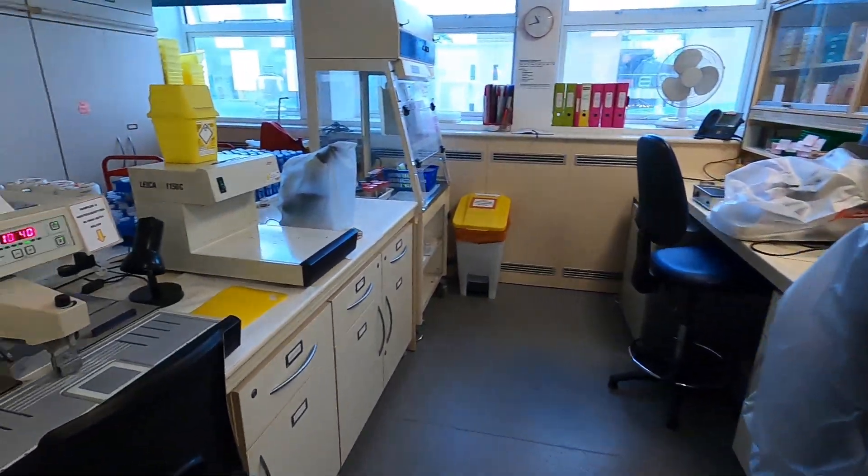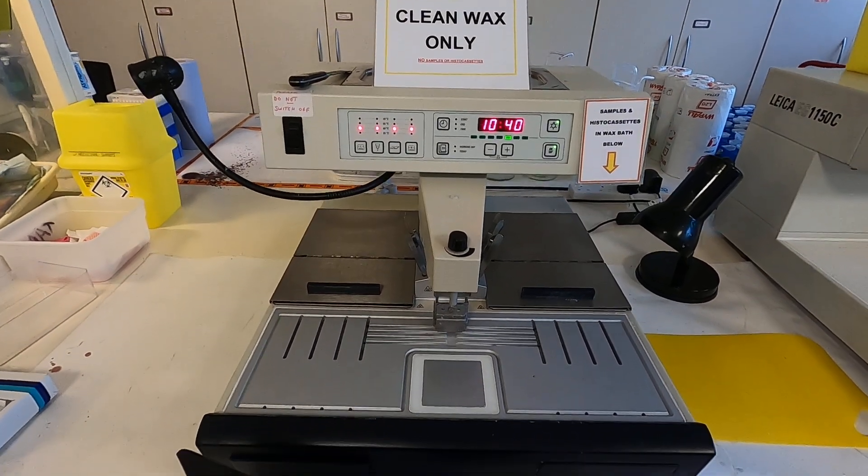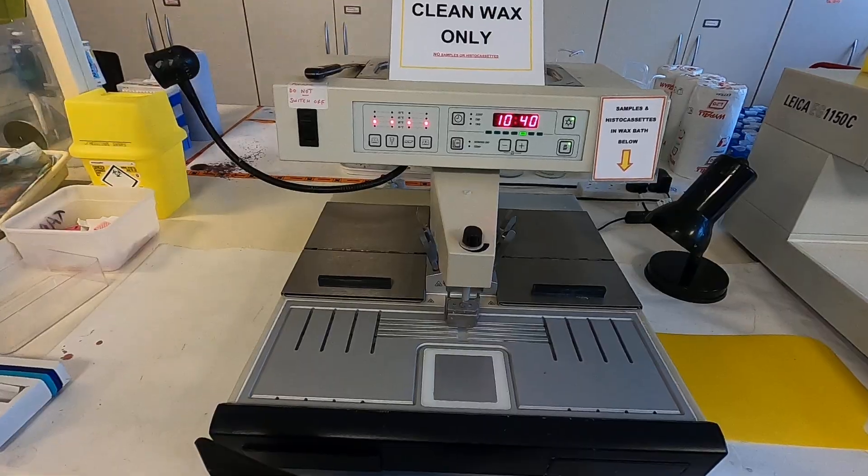What you also have will be embedding stations, and embedding stations are used for basically what it says on the tin — you embed tissue into paraffin wax.